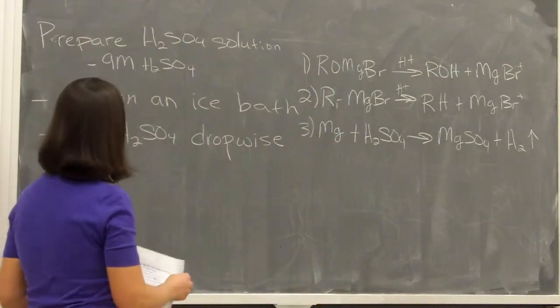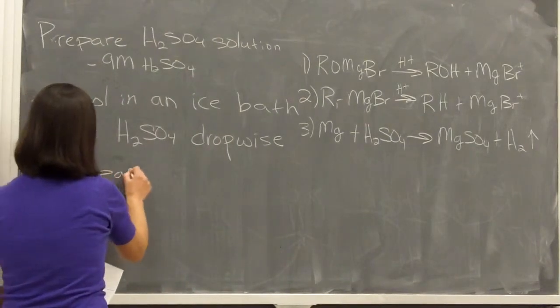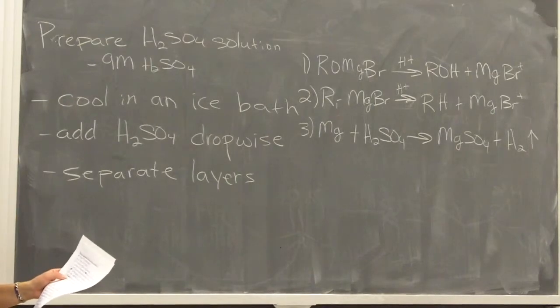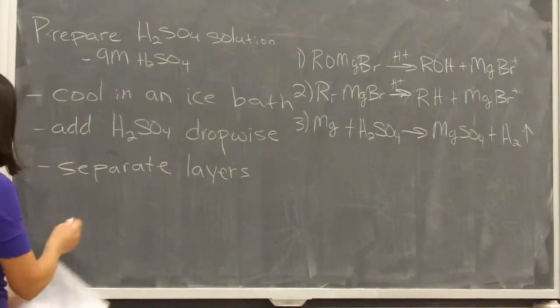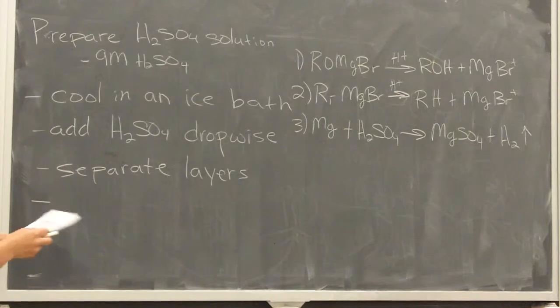Okay? And so you're going into a separatory funnel. You're going to separate your layers. What should be in the top layer? Should be the organic layer, right? We're in ether. That's a lot less dense than water, okay? Now, we're going to talk about some terminology when it comes to workup and doing aqueous workups that you need to keep in mind because these words are going to keep coming up, okay?